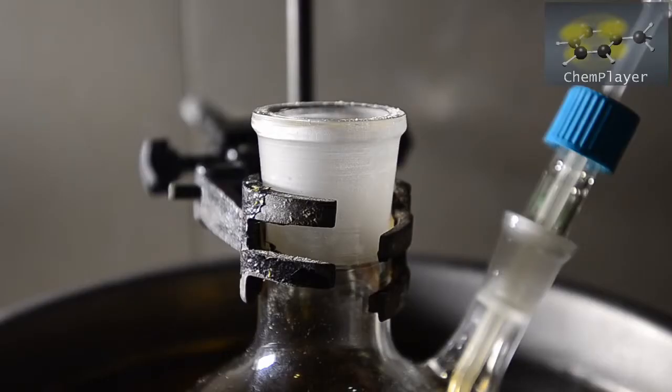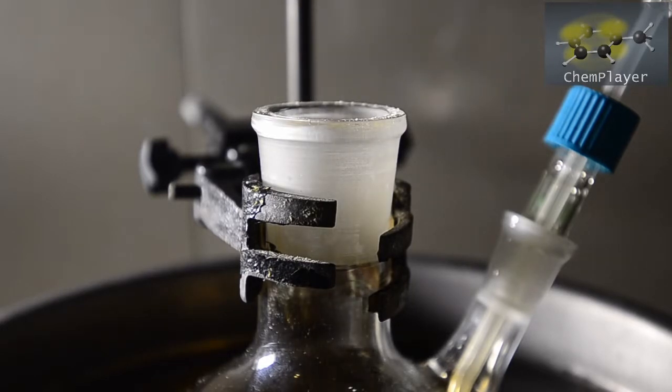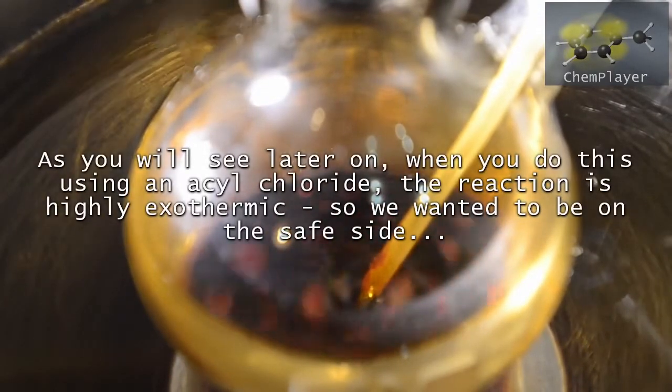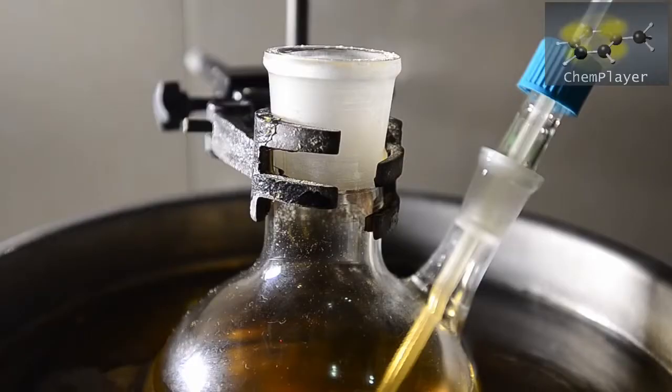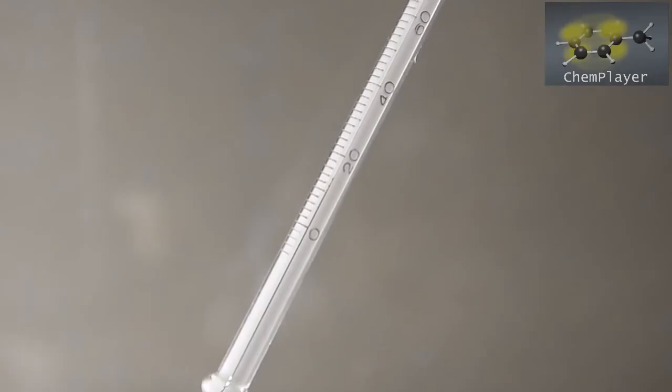And now we're slowly going to add the anhydrous sodium propionate to the flask. We did this slowly because we know that when you do this using acyl chlorides the reaction is highly exothermic. And a little more. After adding half, the temperature has gone up by about 10 degrees. So again, it's not actually that exothermic after all.